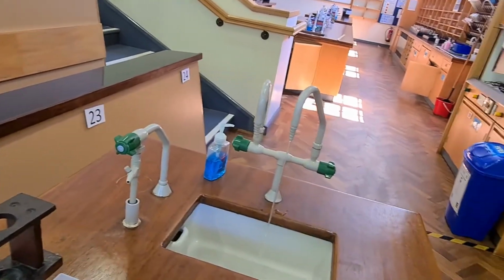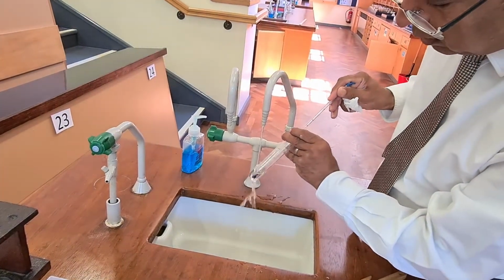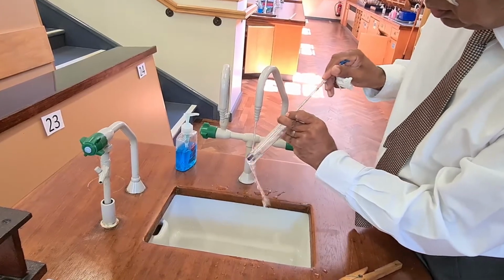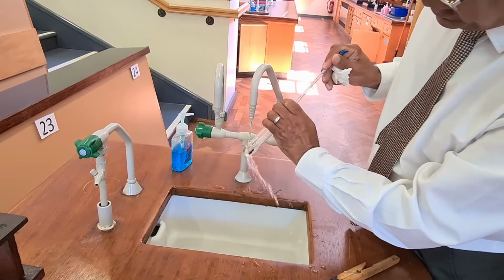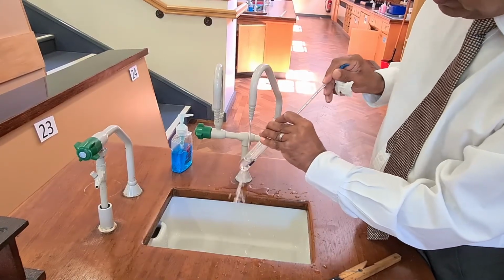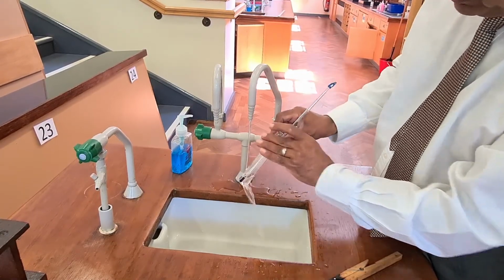Maybe you can watch. Watch me do it like this. Put it under running water. To try and get the insides cooler quicker so that we can get all four results. It will crystallize eventually.